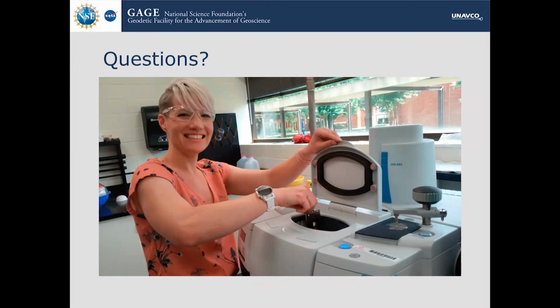To give you an idea, it takes about 30 to 45 minutes to make each sample. It takes 1 or 2 minutes to run the sample, and it's a lot of hard work. When you do the mortar and pestle, you're having to break up the actual potassium chloride crystals, and it's hard. It's fun, but yeah, it's time consuming. That's a lot of work. It was a lot of work.